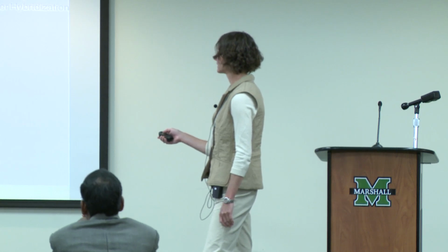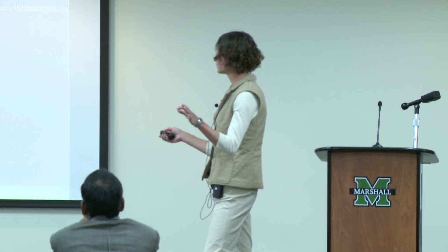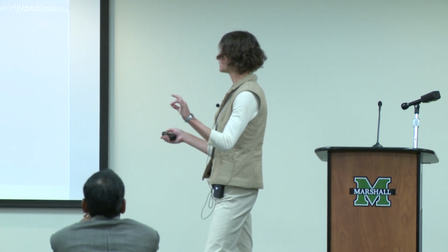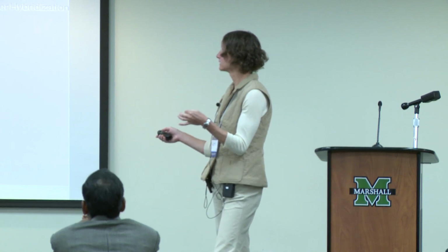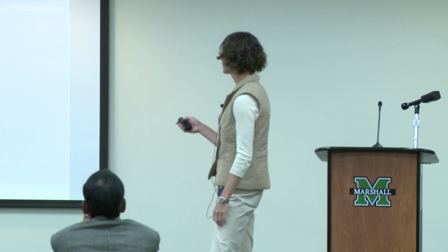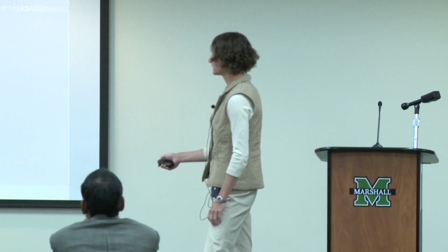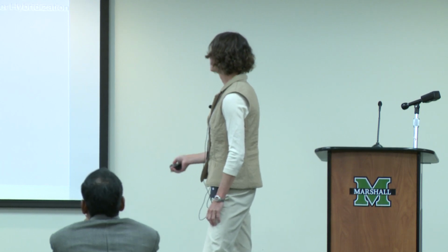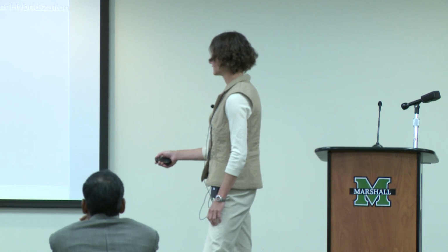It's an iterative process that I don't have time to go into too much detail on, but essentially what you want to accomplish, once you have individual DNA pieces spatially isolated in a lawn across the cell, is to make about 1,000 copies of every initial one you captured, in a small spatially restricted place. Once you've accomplished that, you block these sequences so they can no longer be extended, and you hybridize on what will be the primer that you're going to use for DNA sequencing.